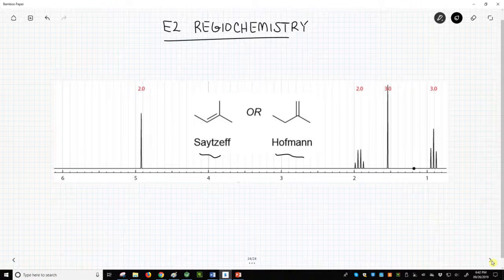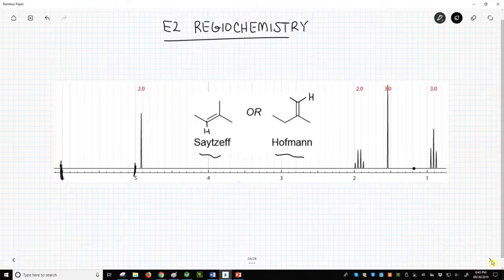What helps us most in this problem is integration. Alkene hydrogens appear normally in the 5-6 region. The Saytzeff product should have 1 alkene hydrogen. The Hofmann product should have 2.